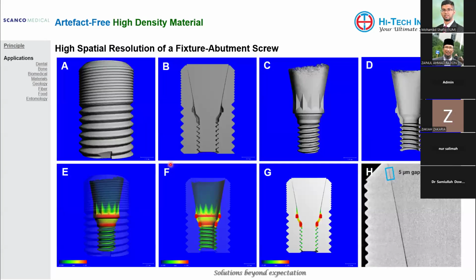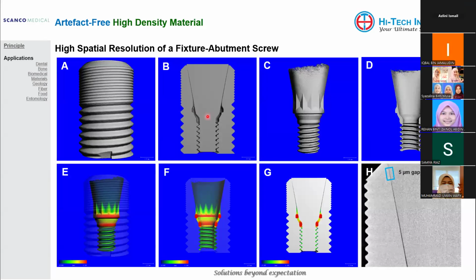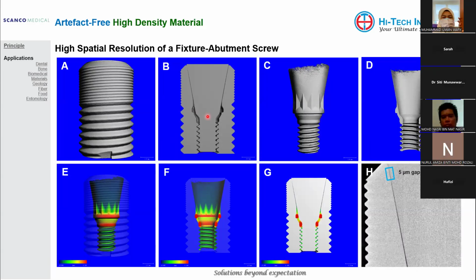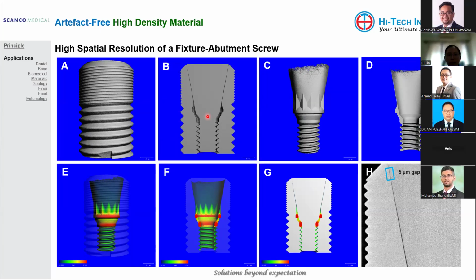And move on to the tooth, we go into the implant. So you can see this is the implant and this is the abutment, the screw itself. This is titanium and it ranges about 3 to 5 mm. Normally, it's commonly used for the implant. Please correct me if I'm wrong.